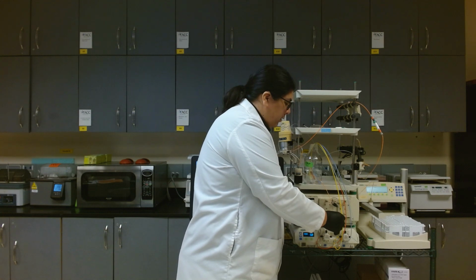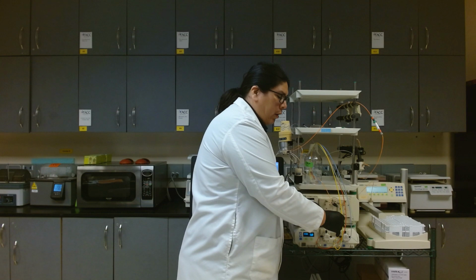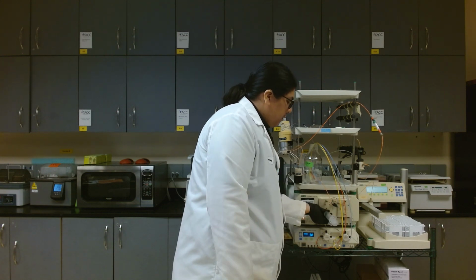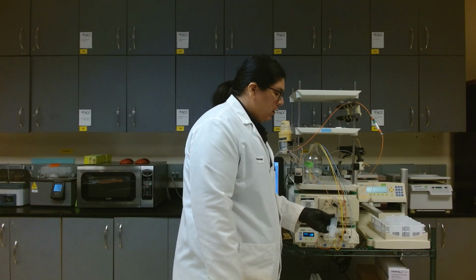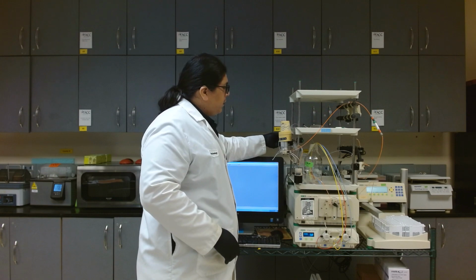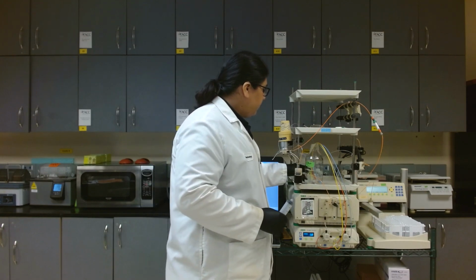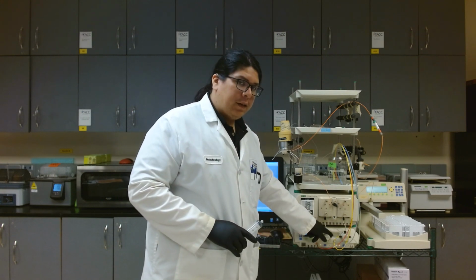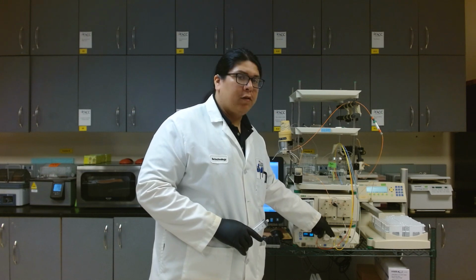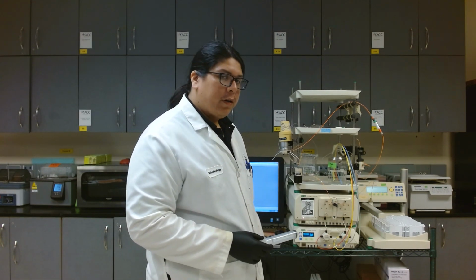So I'm going to draw on this 10 to 20 milliliters. You're going to feel a good amount of resistance, but just keep pulling. And once that's done, close the port, and we'll pull off the syringe. There's a waste container here that I'm going to put that into. And then now we have to do the second port on the first pump. So this is port A1. Now we're going to do the blue line, which is port A2. I can switch to port A2.